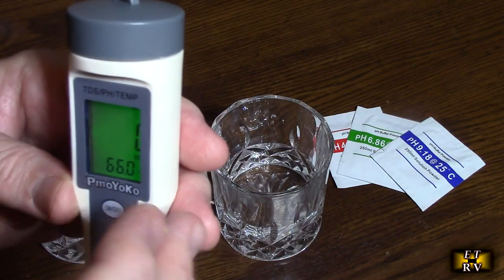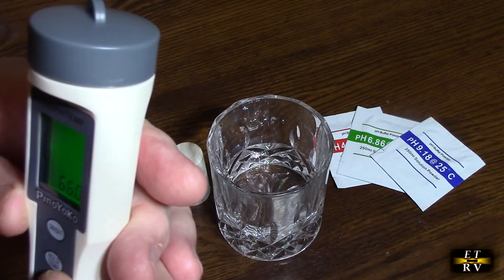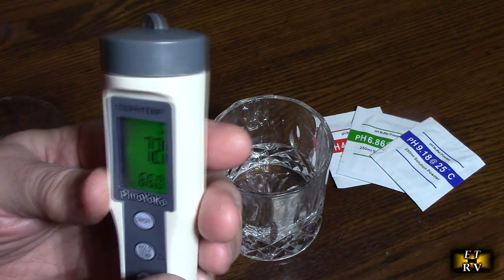So this is an excellent product if you have a water filter, you have a fish tank, and you want to make sure that you want to test the pH. So let's just test some pH right here.